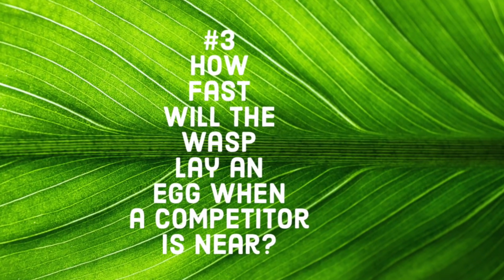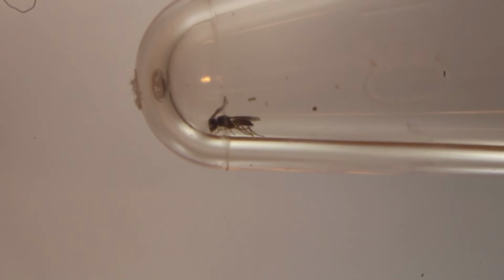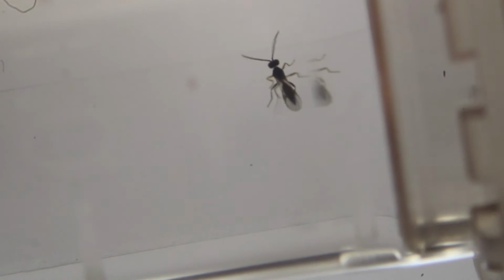For my final experiment, I took 1 aphid and introduced it to 2 female Lysiphlebus, and I was going to record the time in which one of the females oviposited an egg. I set a stopwatch and I kept an eye on it, but I didn't give them longer than 5 minutes.